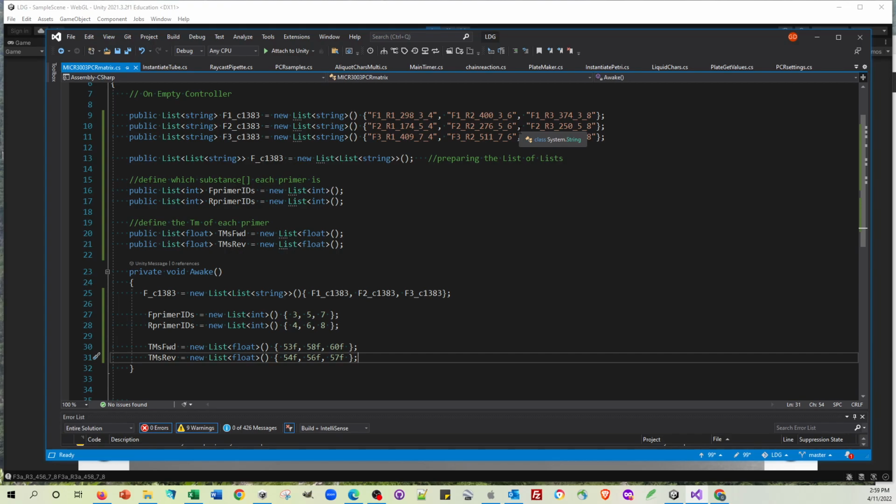And so that completely makes it possible to design whole projects and maybe even link to actually known bioinformatic data sources. So if you know that a particular primer, a pair of primers produces a particular product, then that may be able to come from the bioinformatics site directly into this.